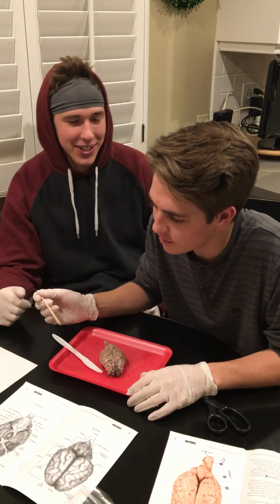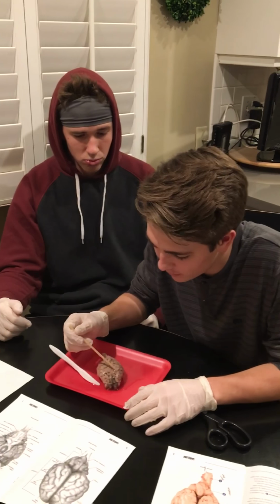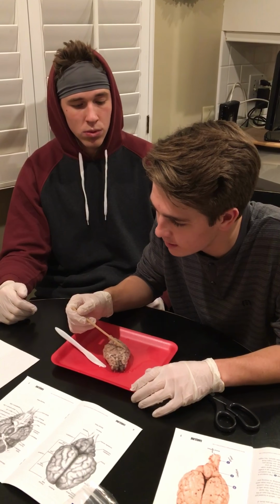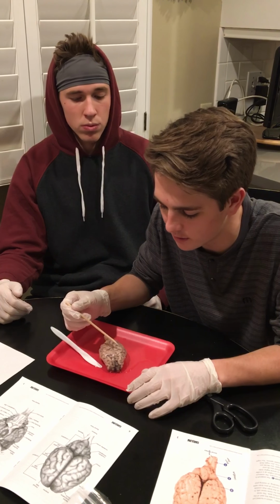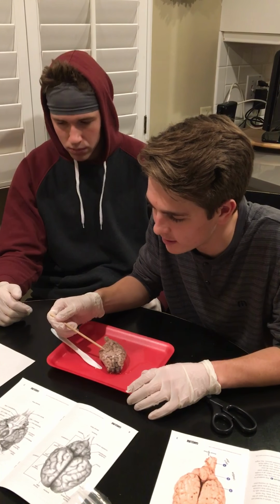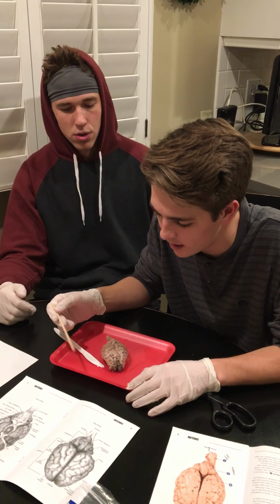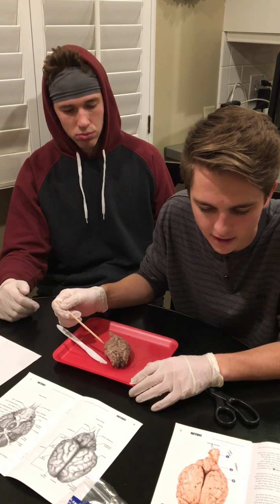Alright, so we'll start off. This is the left hemisphere of the brain on this side here. It actually controls the right side of the body as well as your logical thinking. And then here's the right side of the brain, which controls the left side of your body and kind of controls your creativity side.